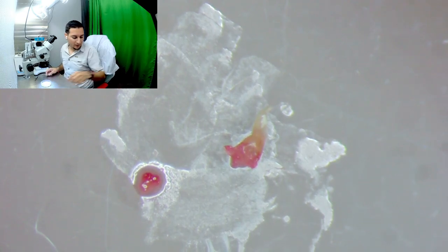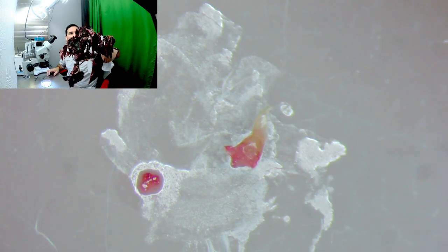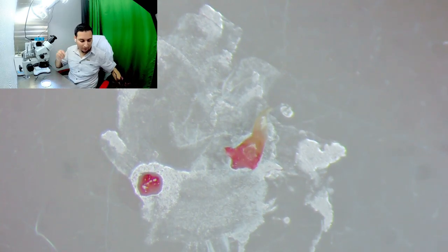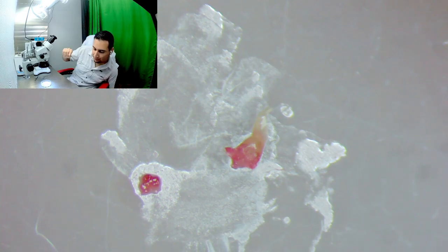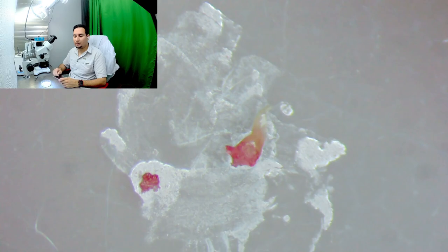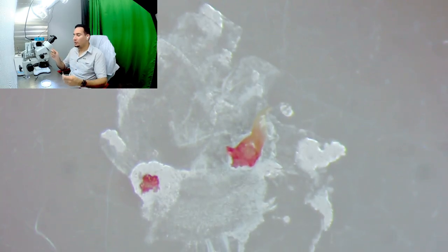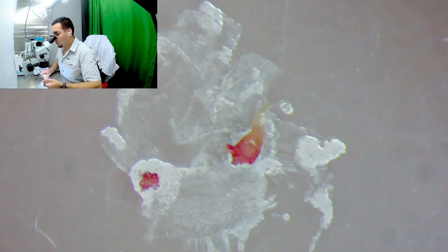Let's say you take a begonia and take some of the lateral shoots, give it a quick sterilization, and as you remove those leaves the inside is going to be clean. Obviously I'm not changing my scalpel or forceps right now, but after removing each layer or every couple of layers, you want to keep sterilizing your scalpels and forceps. That's all you need to do.